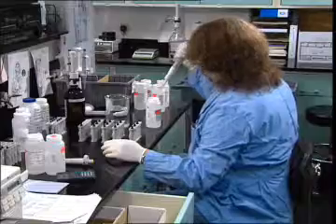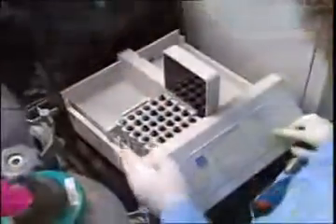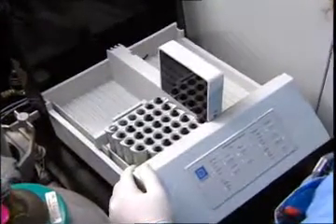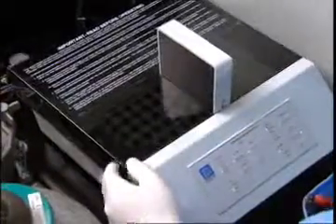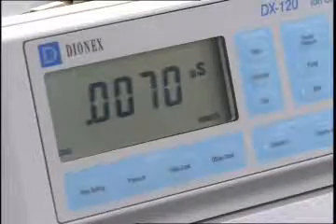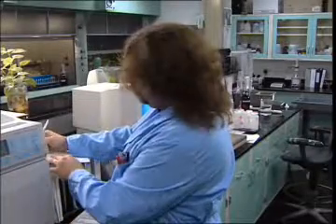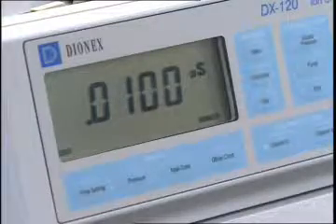Scaling down the magnitude of procedures and experiments offers enormous potential for waste minimization. Careful planning is required, and often more sensitive analytical instruments must be used, but these techniques save on raw materials and on waste disposal costs. Some researchers are running microscale procedures that use as little as 25 milligrams of solid or 100 microliters of liquid reagents.